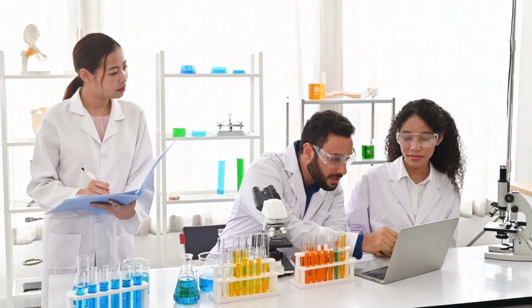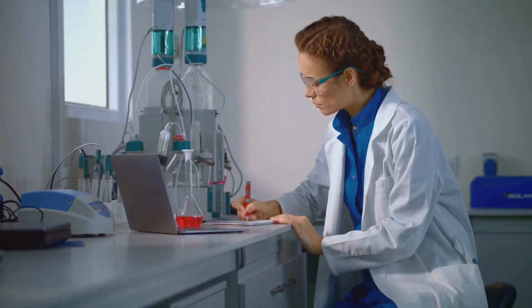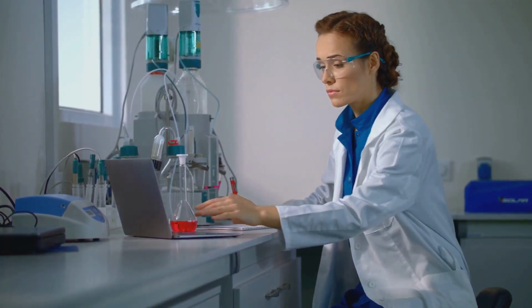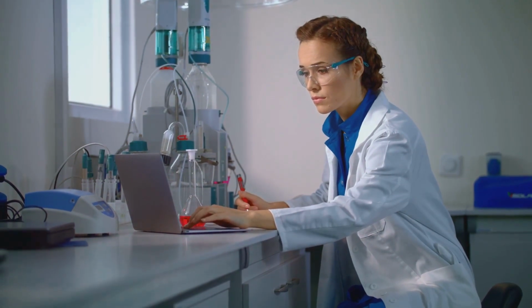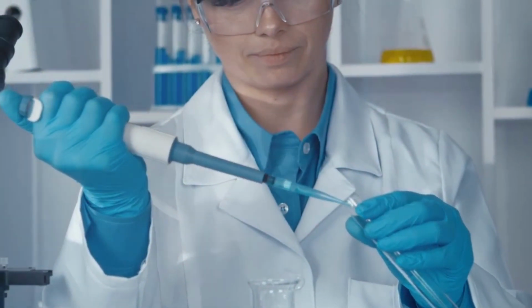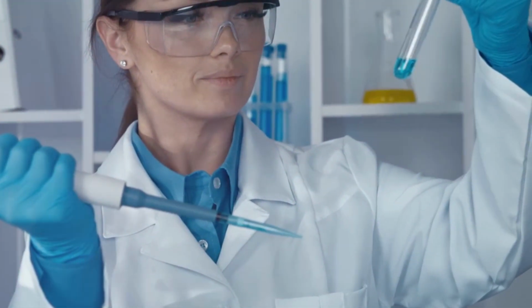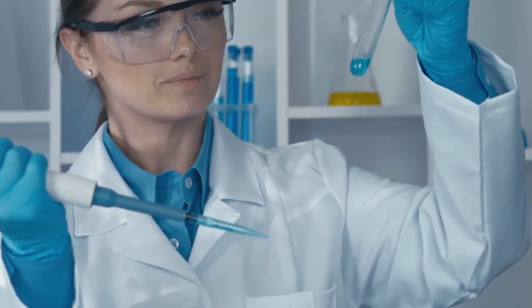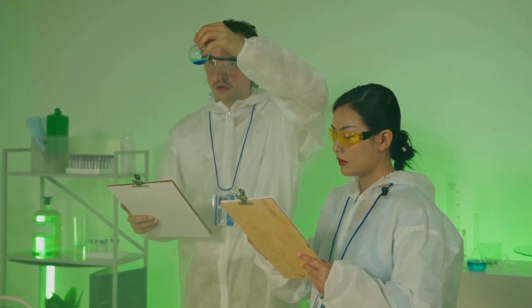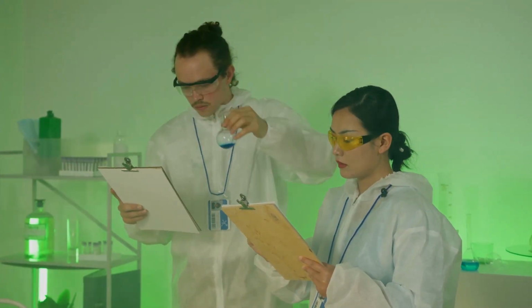Start by asking yourself, what's my main goal with this protein experiment? Are you aiming to preserve its function, analyze its structure, or simply extract as much as possible? Clarifying your objective is the first and most crucial step in choosing the right detergent. If you need to maintain protein function, like binding, transport, or catalysis, opt for gentle detergents such as DDM or LMNG. These help keep proteins active and stable, which is essential for functional assays. Avoid harsh detergents like SDS, which can denature proteins and destroy their activity, making them unsuitable for functional studies.